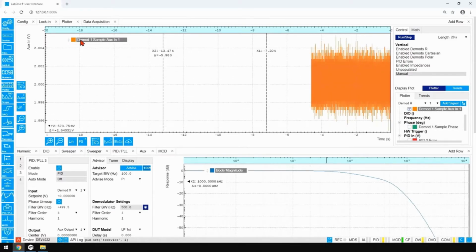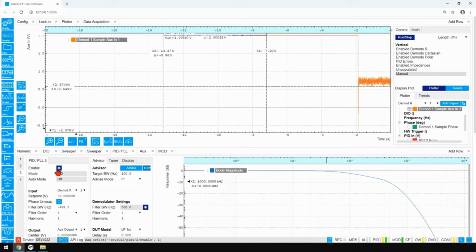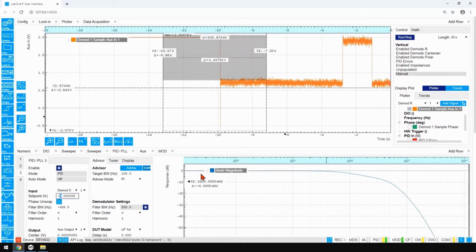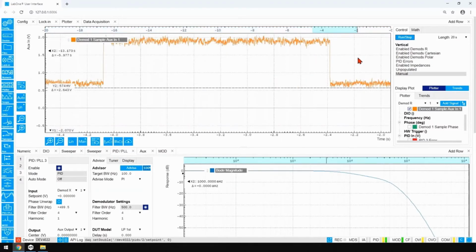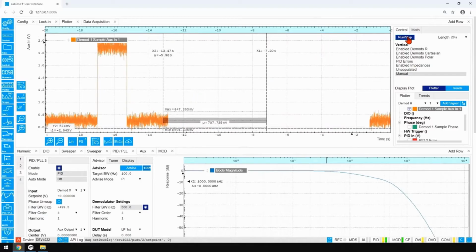So let's make it this way. When I close the loop, I see that the value jumps to CPD again. And if I change a little bit a step response, I get something very similar as before. So quite sharp, even if the gain is smaller.